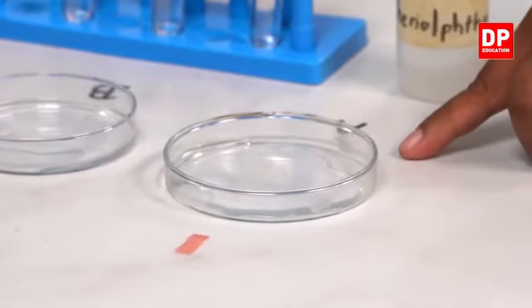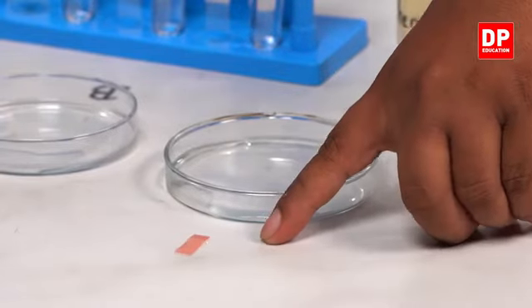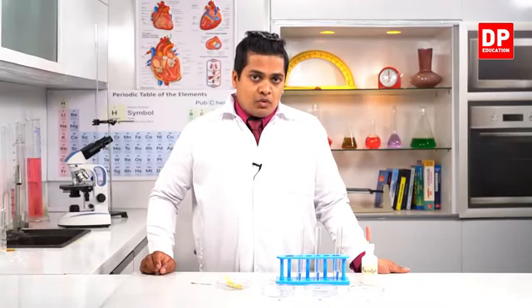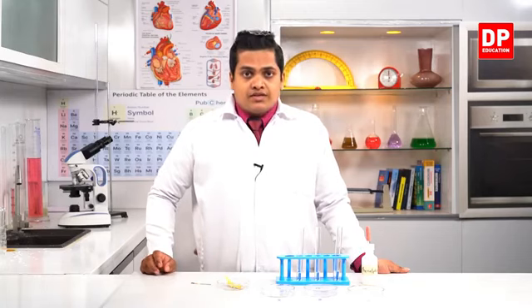So acids will turn blue litmus to red color. This is a unique feature of acids. We can use blue litmus papers to identify acidic solutions. With the presence of an acid, blue litmus turns to red color.